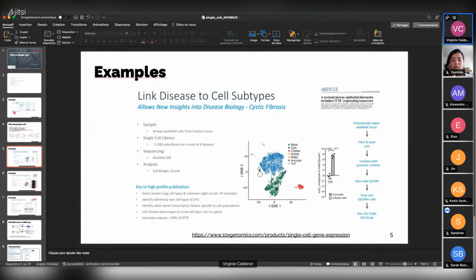Here you see this is really, really small. That represents 0.5% of the cells, so it's a really, really rare cell type, and they were able to link this to a phenotype in the case of the cystic fibrosis patients. So that's something you can do with single cell, is to detect really rare cell types, contrary to bulk RNA-seq, where you just have the mean signal of the transcriptome.